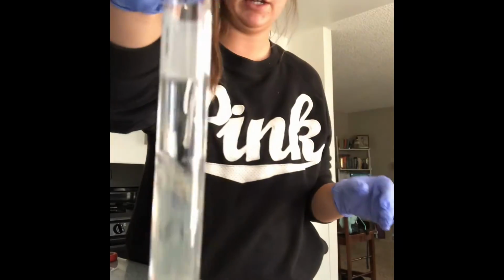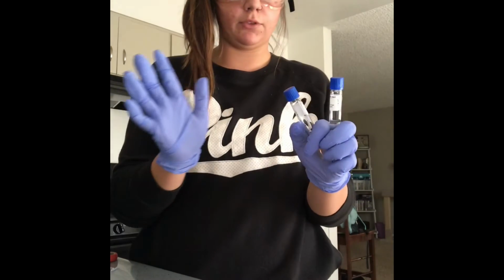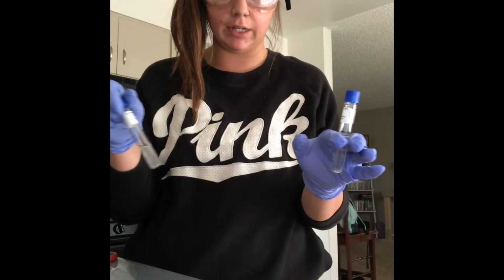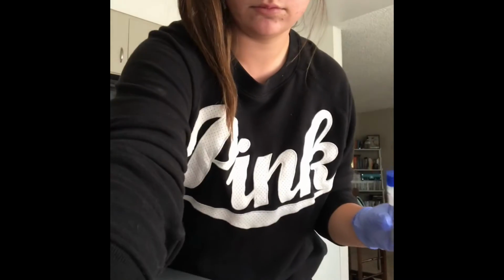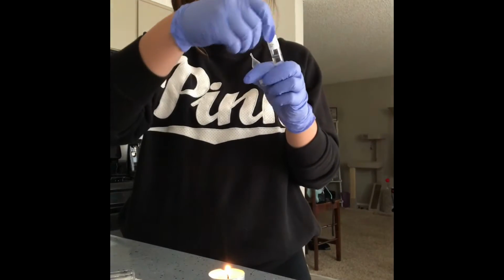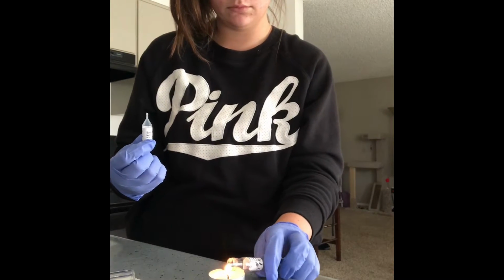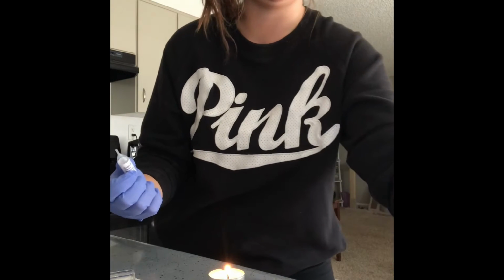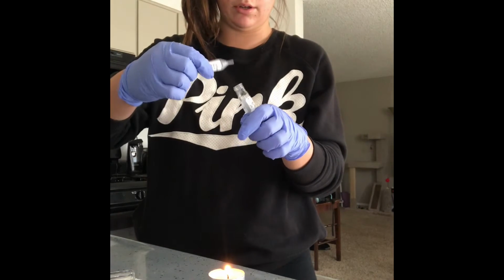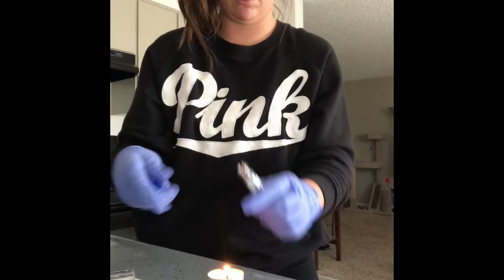So I have S-epi here, my active culture. What I'm going to do right now is just prepare to transfer my S. epidermidis into each of my S-epi pHs, 5, 7, and 9. So I have my sodium hydroxide right here. My pH of 9 for S-epi, so I'm going to remove the cap and just sterilize. And then I'm going to place 1 drop of this in here, of the sodium hydroxide. So that's 1 drop. I'm going to sterilize and recap.